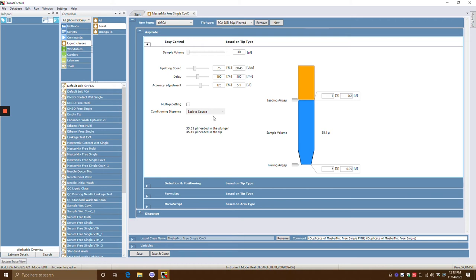Multi-pipetting is if you're going to pipette multiple times from one aspiration. Think of it as: suck, spit, spit, spit — versus aspirate, dispense, aspirate, dispense. It's do a big aspiration and then dispense multiple times. These are all very important functions.